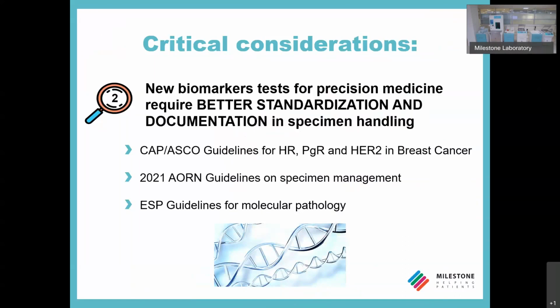There is another critical consideration in biospecimen handling and collecting. The second critical aspect that I point out today is that we need to strongly consider the preservation of the molecular material of the biospecimen. In past years, the progress in precision medicine and personalized treatment required additional tests beyond the morphological evaluation normally done by pathologists. These are tests like DNA, RNA, and protein extractions for gene expression profiling. For these tests, it is important to maintain the tissue in perfect condition and to control the pre-analytical variables.